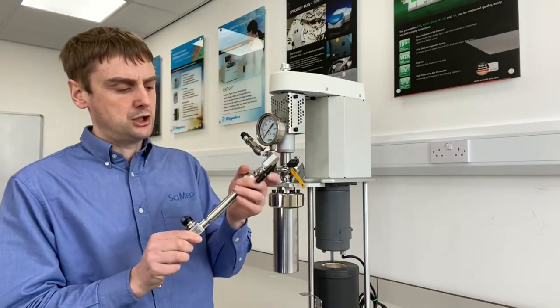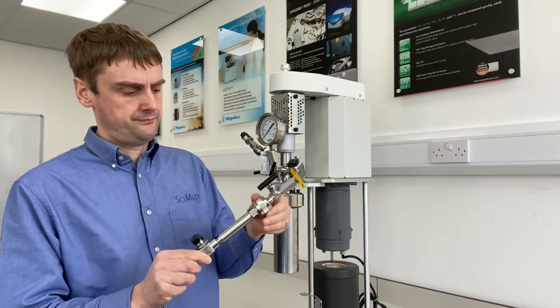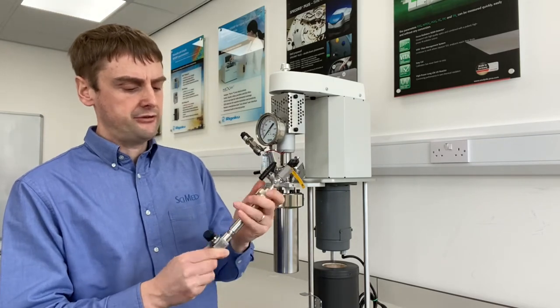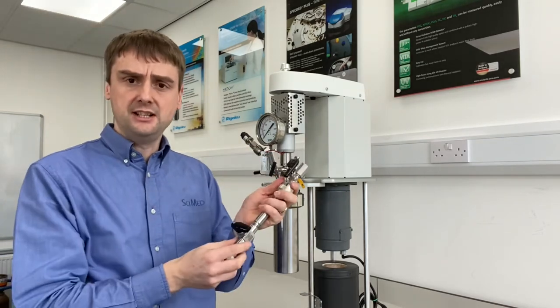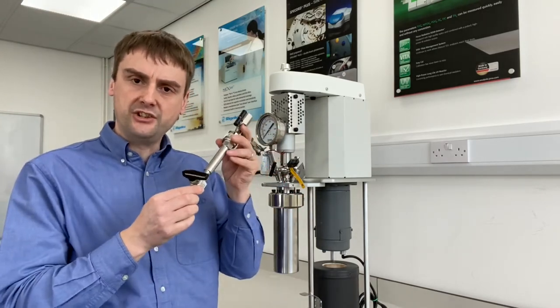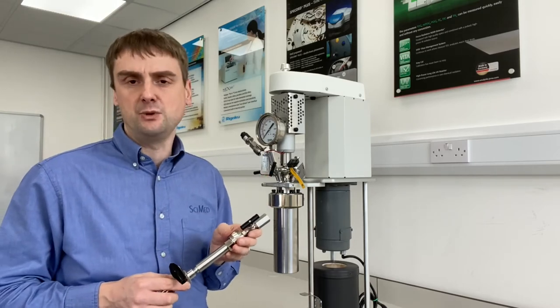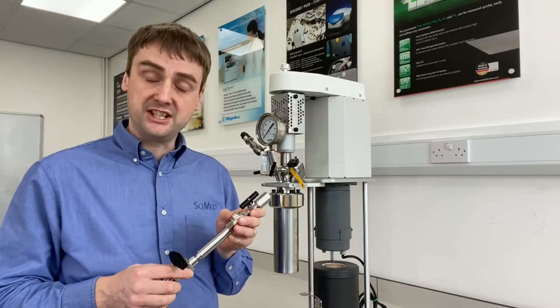You can then close it up again inside the glove box. You have both of your valves shut, and then you can remove it from the glove box with your catalyst under an inert atmosphere. This is obviously for the case where you have air-sensitive catalysts.